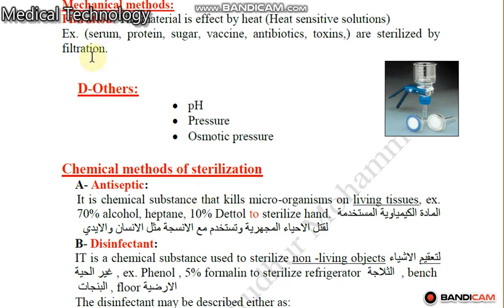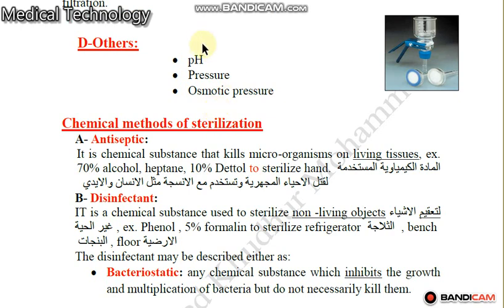There are other methods for sterilization like pH, pressure, osmotic pressure.